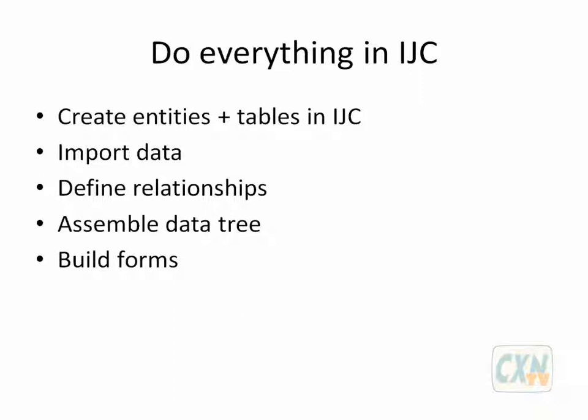You might do that by importing the data in from files like SD files or comma-separated files, or you might create empty tables and then load the data in row by row. Once you've got your data in, you might create relationships between the tables if you want to use relational data, and then you'd assemble the data tree. That's analogous to the ISIS HView, and then you'd build some forms so that you can see and query your data. So that's the standard sort of end user thing that most people are probably familiar with.